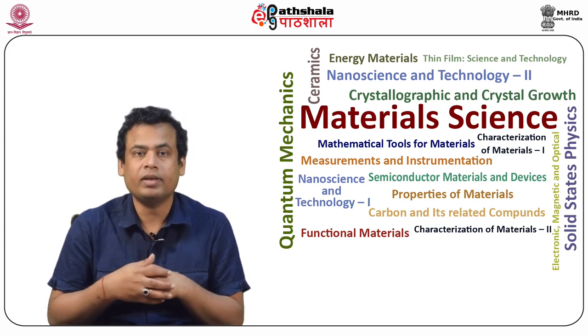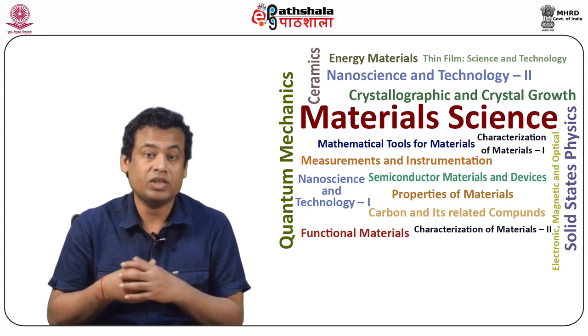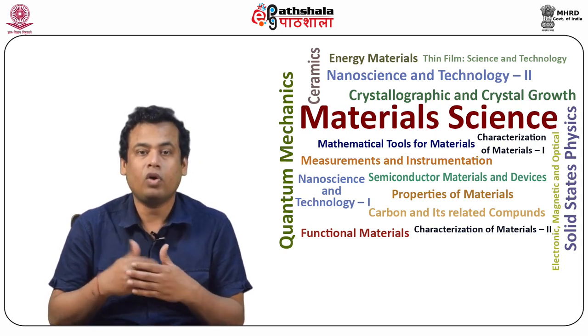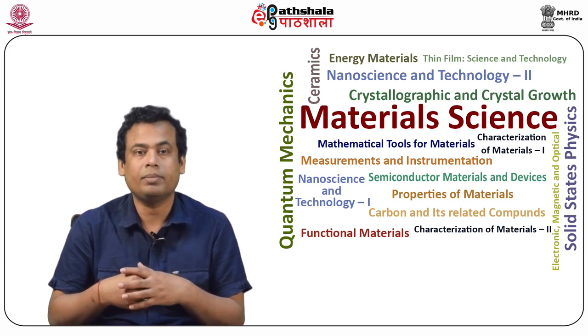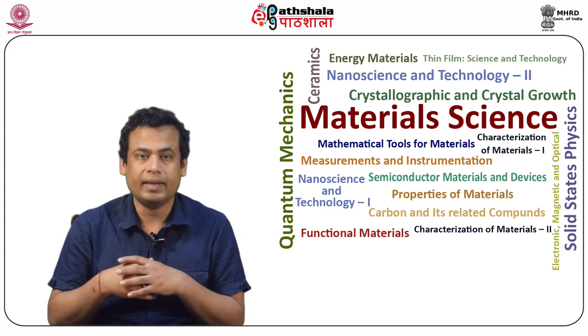Each scattering event might occur as an elastic or inelastic interaction. Hence, the total interaction cross section sigma t is the sum of all elastic and inelastic terms, which can be estimated as sigma t equals sigma elastic plus sigma inelastic.